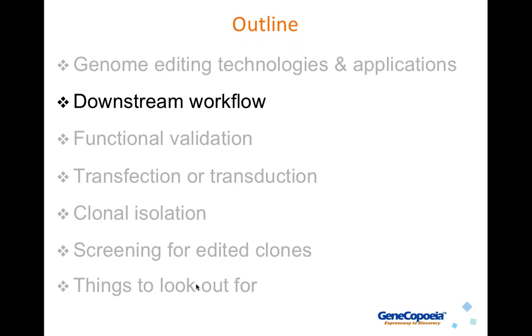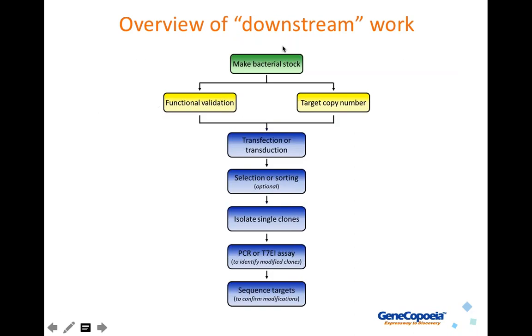All right, so now that I've given you that overview, again, this is not a seminar really about CRISPR itself, but about how to use it. Now I'm going to talk about this downstream workflow, how to use CRISPR. So here's a figure that shows an overview of this downstream work.